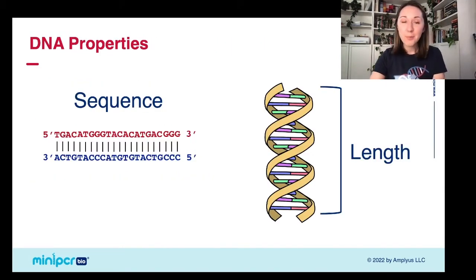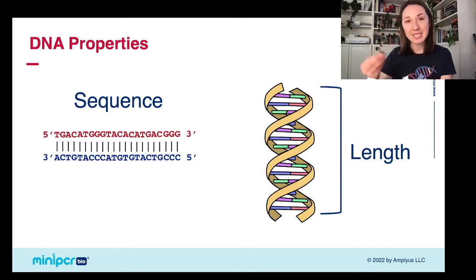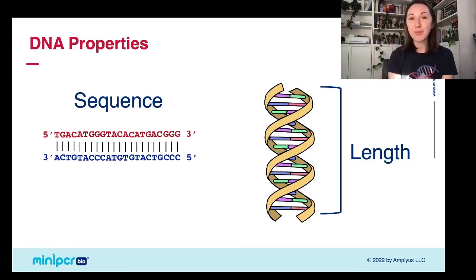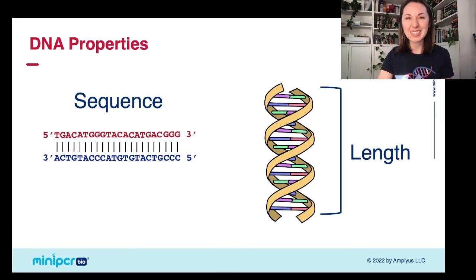Now, there are a couple of different properties that you could think of that DNA has when we're talking about separating DNA molecules and characterizing them. One, of course, is the sequence of those DNA molecules. So thinking about the actual sequence of the A's, T's, C's, and G's in your DNA. But what gel electrophoresis does is it separates the DNA based on a really physical property, which is the size or length of that piece of DNA. And that might sound a little unusual, but I bet you're very familiar with separating other things by size. And we'll get to that in just a second.